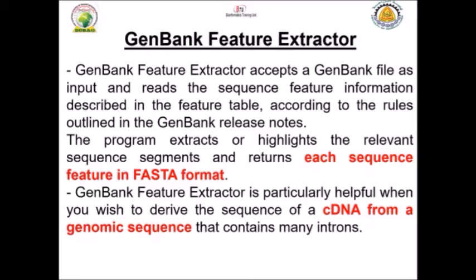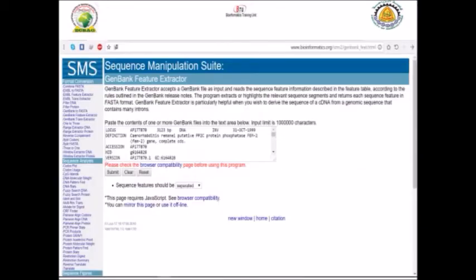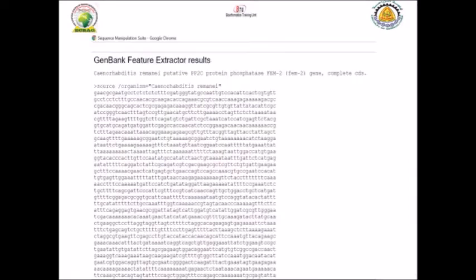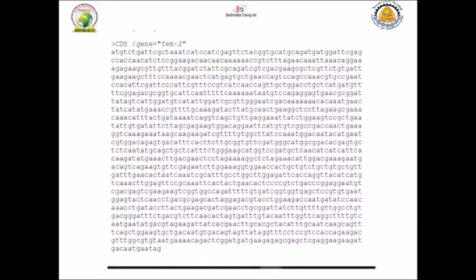It's very simple: you copy and paste your GenBank information for the gene into the input box, and when you press submit, you will get the genomic DNA sequence in FASTA format, the messenger RNA sequence, and the cDNA sequence in FASTA format. You can then predict the size of your cDNA, which is useful for cloning or genetic engineering.